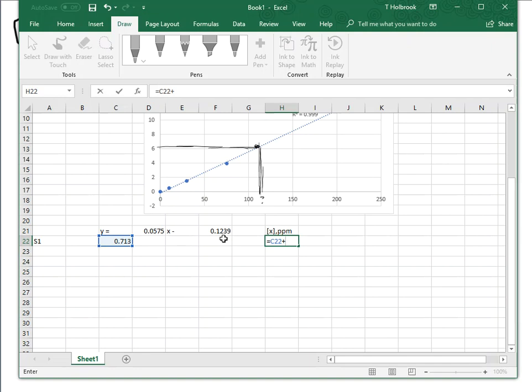That's minus 0.1239, so we did the opposite of. We added 0.1239. I'm just going to click that number. That automatically tells Excel that that's the number I need to use, and that saves me from writing it again, right? Well, we need that to be done first.